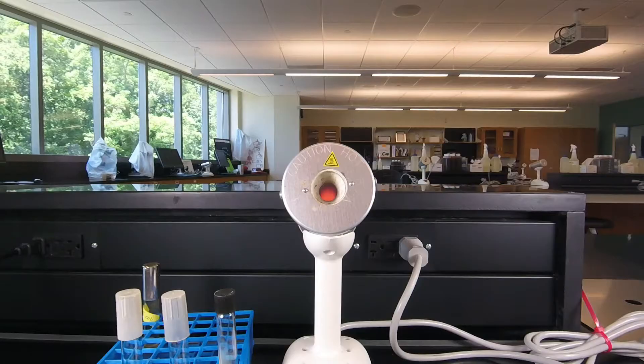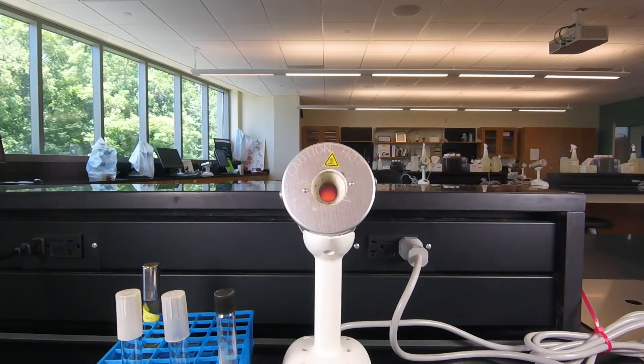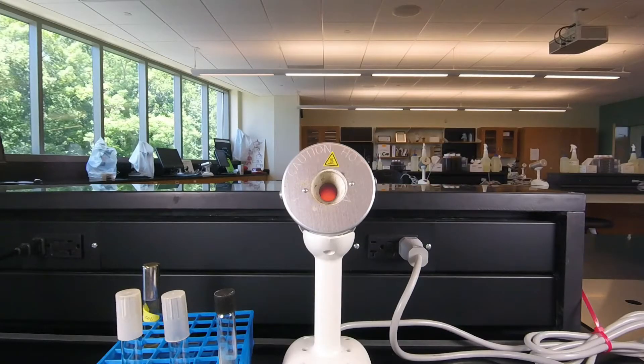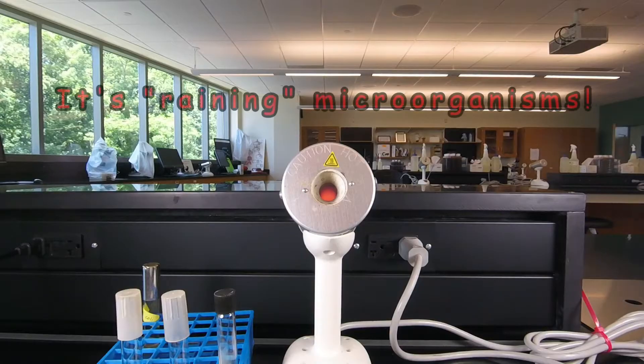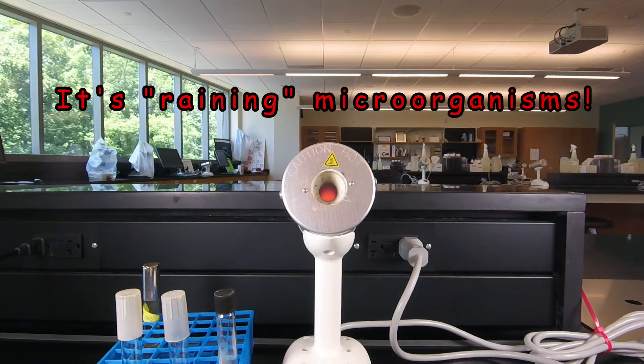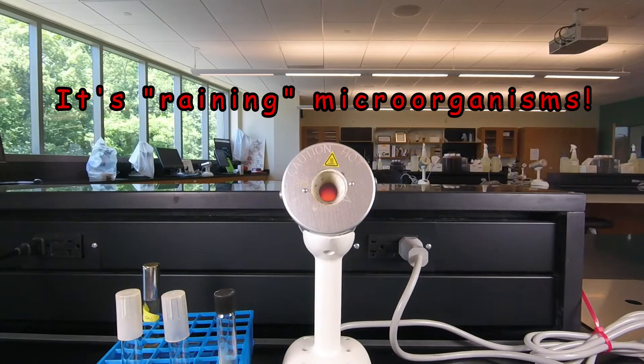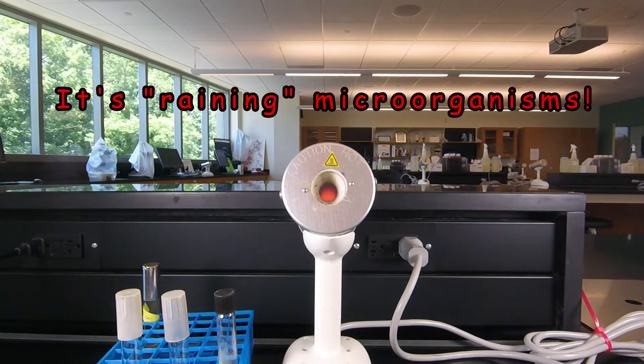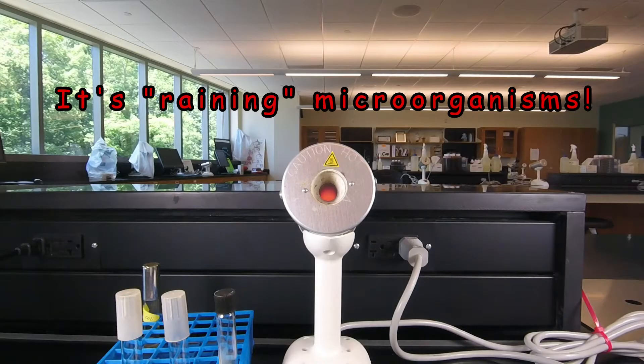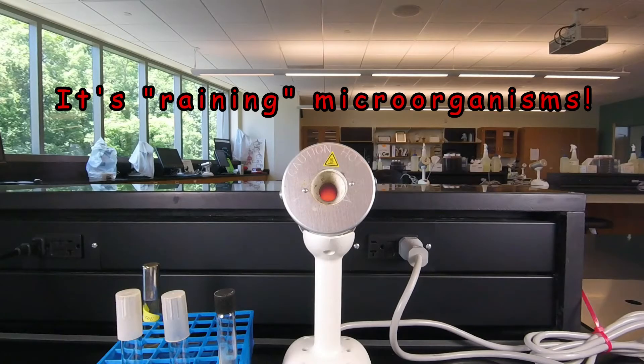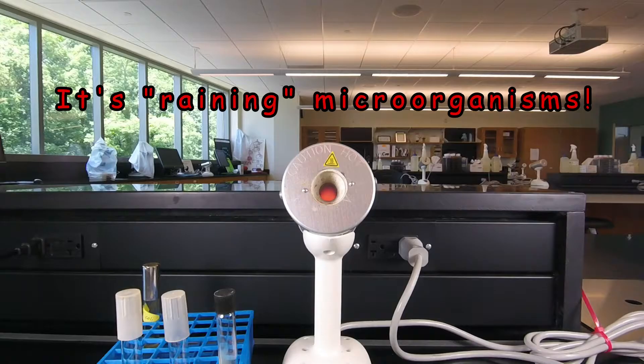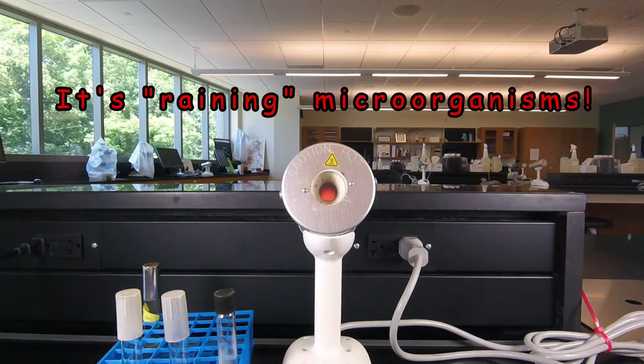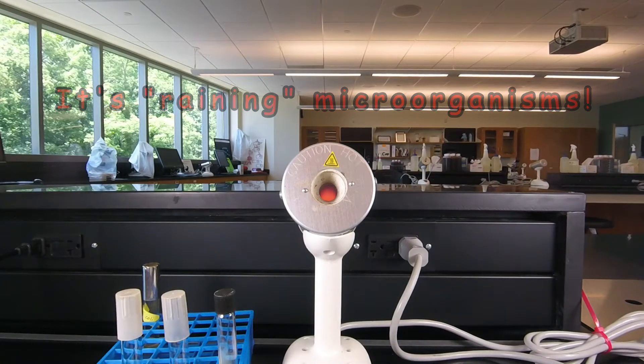We have to keep in mind that microorganisms are everywhere and when we're working with them in the lab we need to keep in the back of our mind that it's always raining microorganisms. Mold spores, bacteria, these are on dust particles being pulled down by gravity. We're shedding microorganisms from our body, from our clothes and these are all waiting to contaminate our culture tubes or our petri plates.